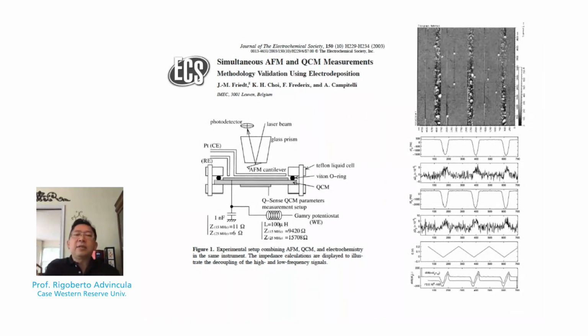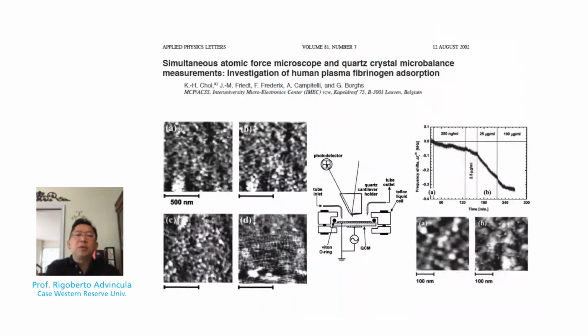experiment. Now, this paper, from the same group, shows the simultaneous AFM and QCM experiment where we're investigating human plasma fibrinogen adsorption.